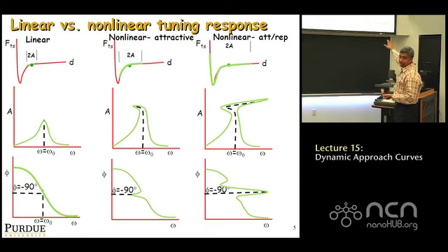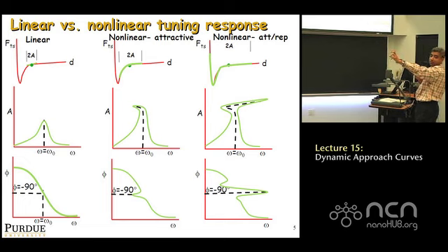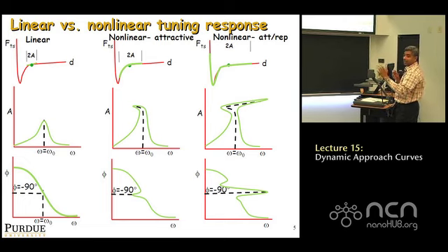As you go to slightly larger amplitude, so at the same distance now, let's say you're shaking more and then tune the tuning curve, right? So that your oscillation amplitude is large enough that your tip goes through the minimum in the interaction force, but goes into the repulsive regime and back in each oscillation cycle. When you're in that situation and now you sweep the drive frequency across resonance, you get an amplitude versus frequency curve that looks like this. Really cool. Resonance curve is no longer linear. It just gets distorted completely like this.